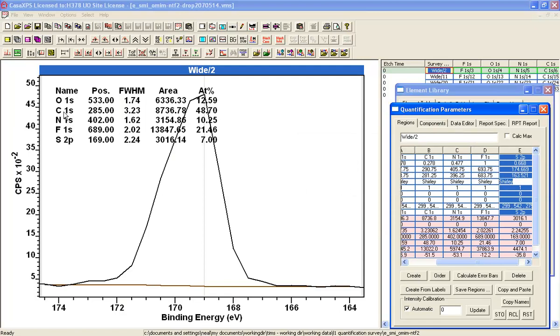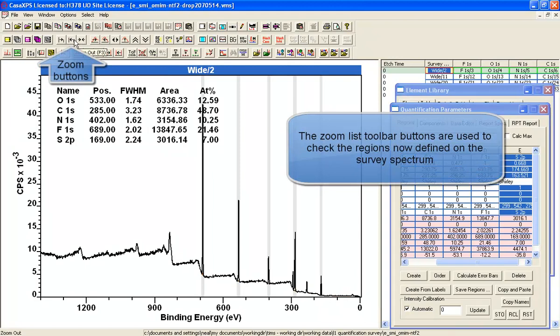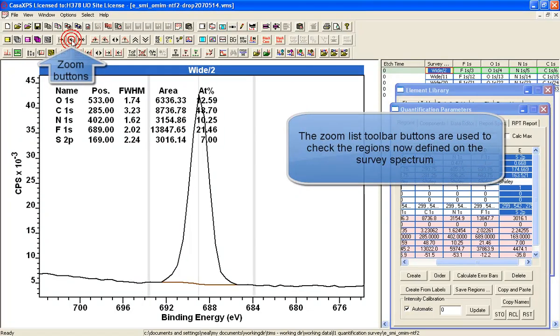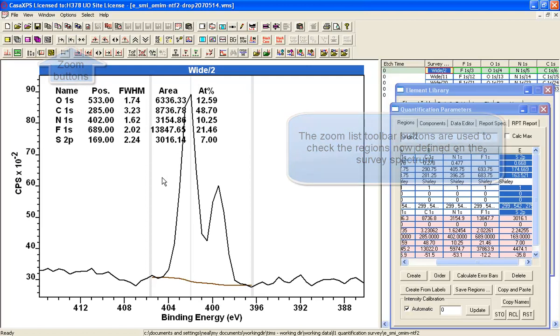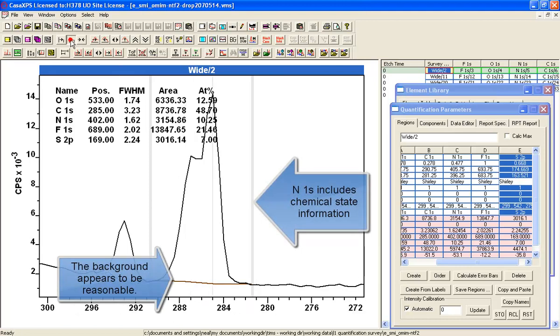Now, the one that I had a query about was going to be the carbon 1S. But we can just check all of them by pressing the reset button and then zooming out. It'll step us through the different regions. And this is nitrogen. It's got some structure here, which is consistent with the nitrogen chemistry. We won't worry about that.